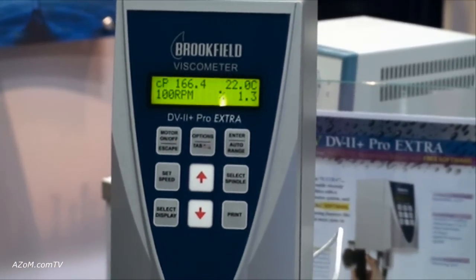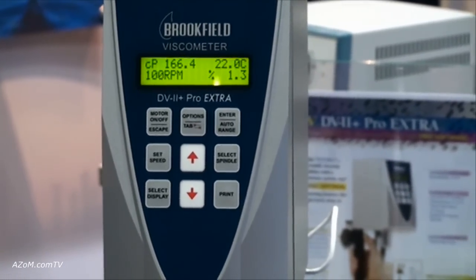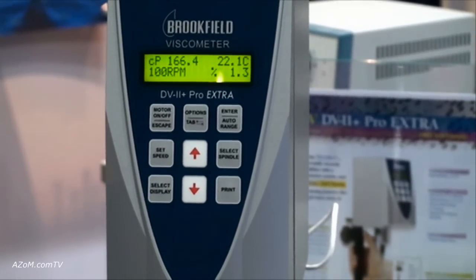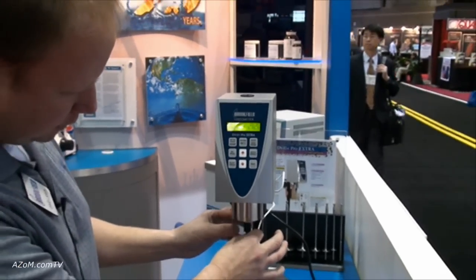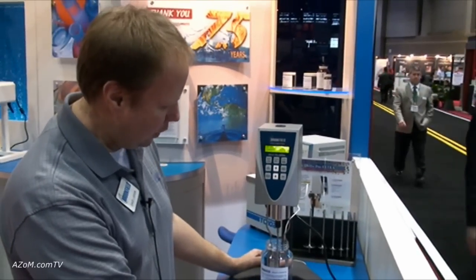And tell me Dave, what do people usually use these for? What industries? Cameron, we use these in all fluid labs — from foods to pharmaceuticals, chemicals, adhesives, paints, and coatings. Most people are familiar with the Brookfield viscometer. We've been doing this for 75 years, and it's just a standard of the industry.